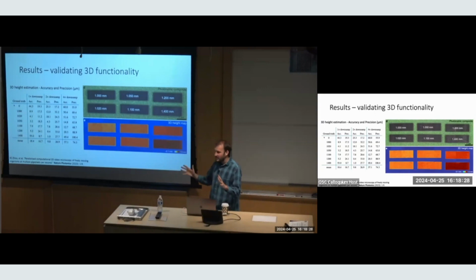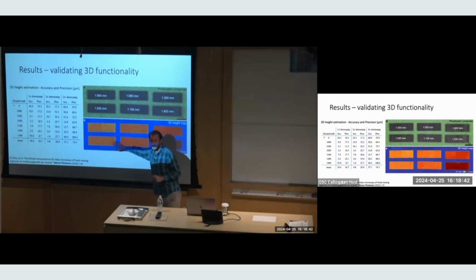Arguably, visually, you can see we have a gauge block that's 50 microns taller than this one. This one's 20 microns taller. This one's 100 microns taller. You can see 100 microns visually changing, but probably not 20 or 50. That's my gut feeling. We get lots of questions about this.